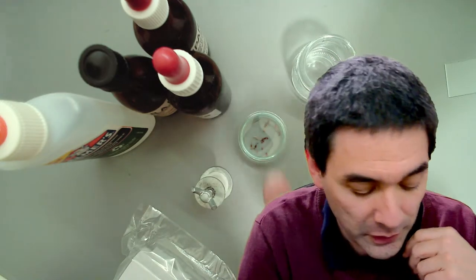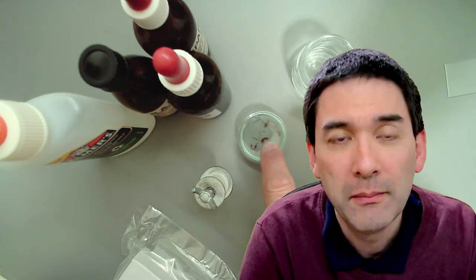Today I would like to simply do the following. I've got a few specimens here, and I would like to simply make a few permanent slides. That's pretty much it. And while I'm making the slides, I'm going to be answering again a few questions.